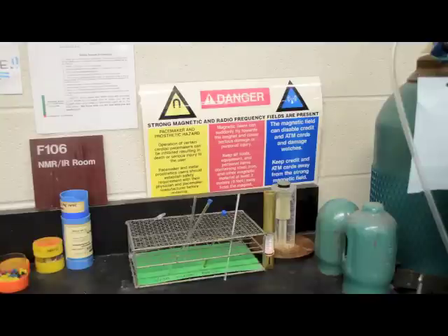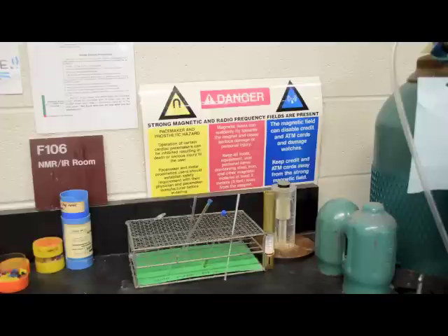First, a word of warning. NMR instruments have strong magnetic fields. Anyone with a cardiac pacemaker should stay out of the NMR room.